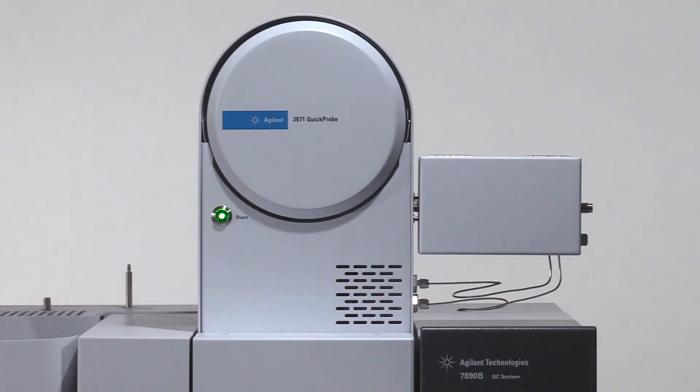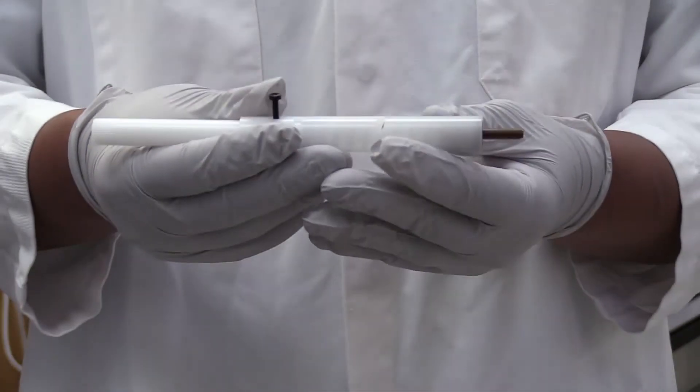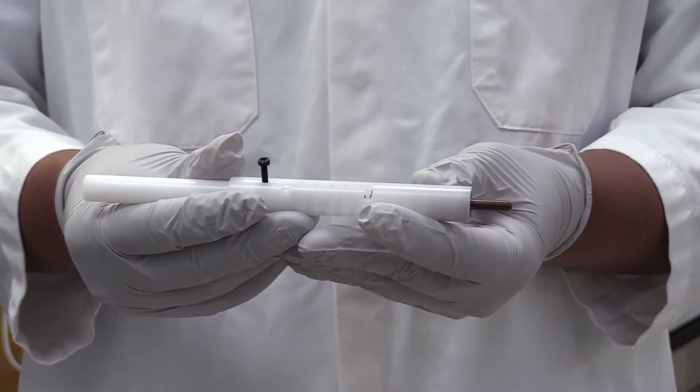Let me show you how simple it is to use QuickProbe. The green light on the start switch lets me know that the system is ready for a sample injection. Here is the Agilent glass probe and probe holder.